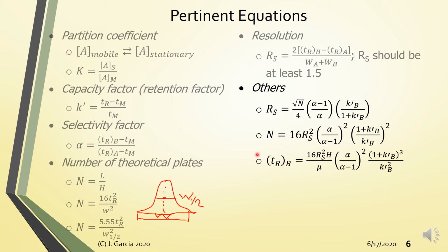Here it shows you the retention time. So what can we say here? The lower your theoretical plate height, the lower the retention time becomes. And in chemical analysis, that is better. It's better to have shorter retention times because it will lead to shorter run times, and shorter run times will give you more time to analyze more samples, because you only need a shorter time to produce the required chromatogram. So you just need to remember these relationships.